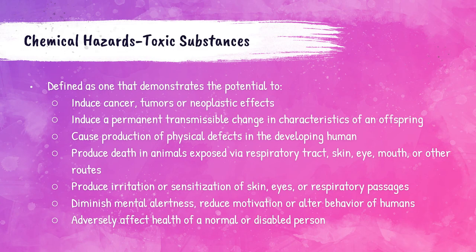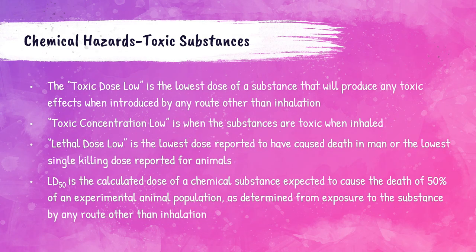A toxic substance is one that has the potential to cause cancer, tumors, or other neoplastic effects; induce a permanent transmissible change in the characteristics of a person's offspring; cause physical defects in the developing human; or produce death in animals via respiratory tract, skin, eye, mouth, or other routes. Toxic substances can also produce irritation or sensitization of the skin, eyes, or respiratory tract, diminish mental alertness, reduce motivation or alter behavior, or adversely affect the health of a normal or disabled person.